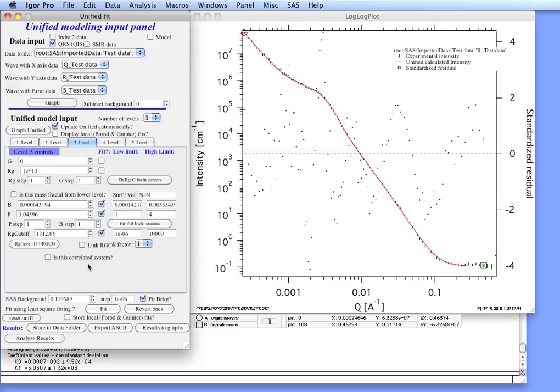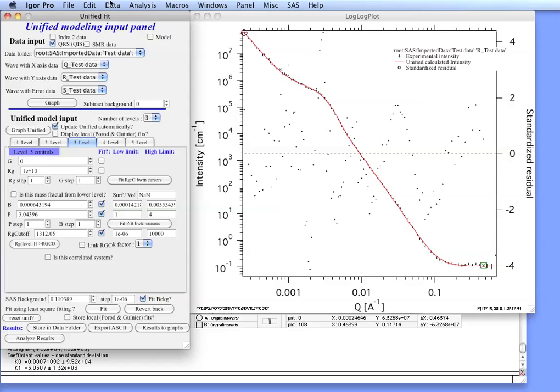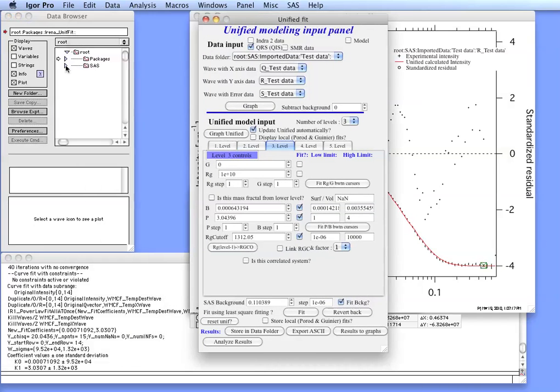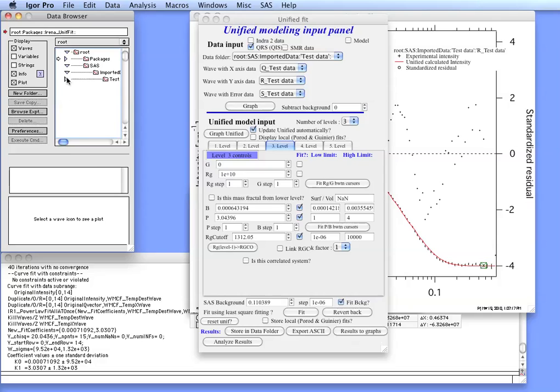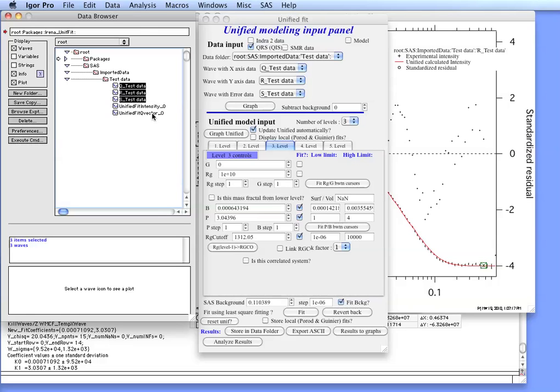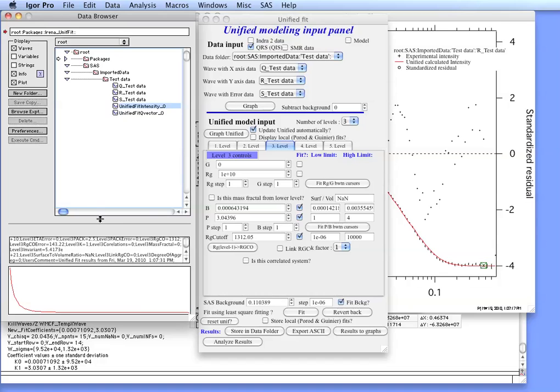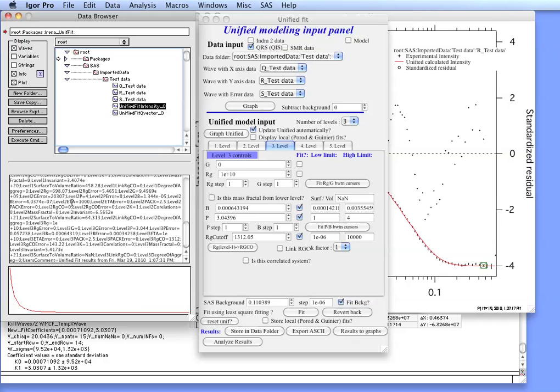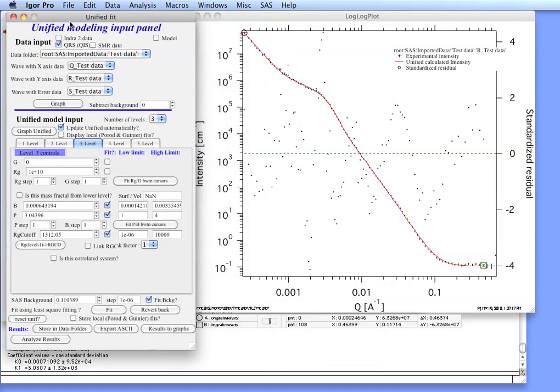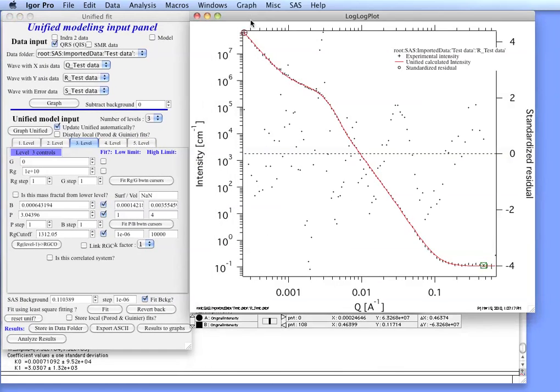And we can deal with it further. The first thing we can do is we can store the data back in the data folder. So if we do that we can put our own comments here if we want to. What Unified will do is in the data folder where the test data are, which is these three data sets, it adds in there two waves which is the Q and the intensity. Part of each one of them is a wave note which contains not only the original wave note but also a lot of unified parameters in here. So in this case we have stored the data. We can then compare them as IRENA results.